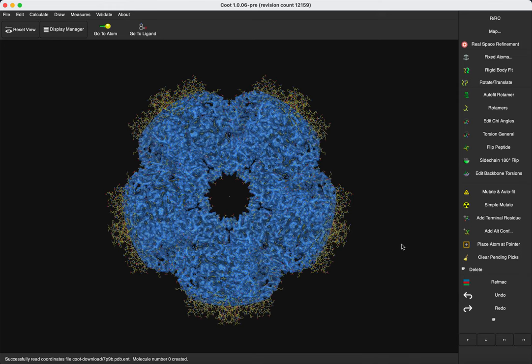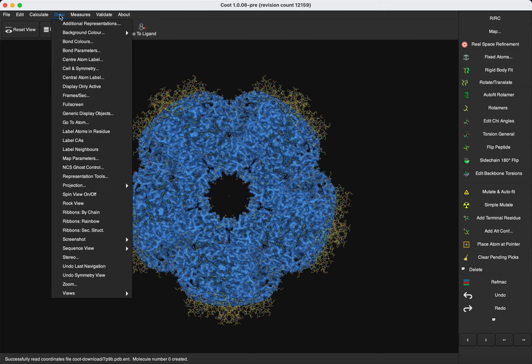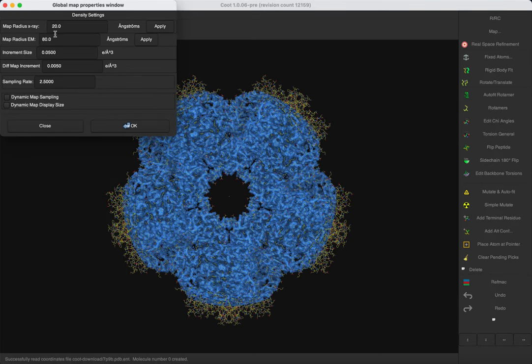The first thing that we are going to do is to increase the radius of the map, because we want that the map cover entirely the model. So draw map parameters, and we are going to increase the radius to 99.